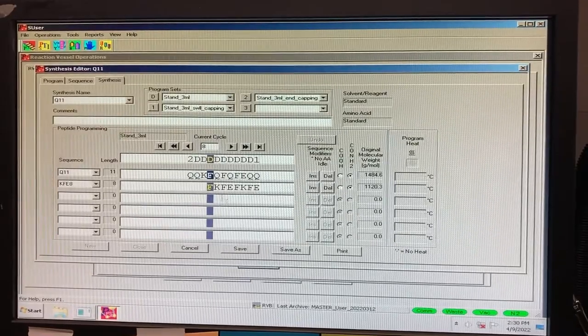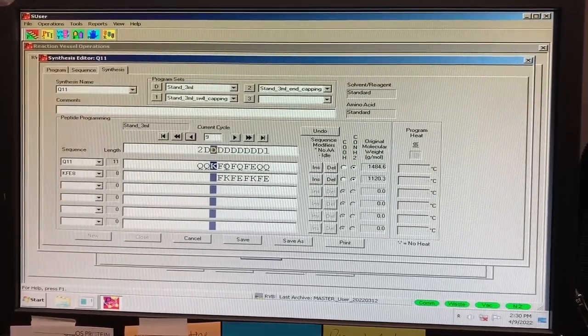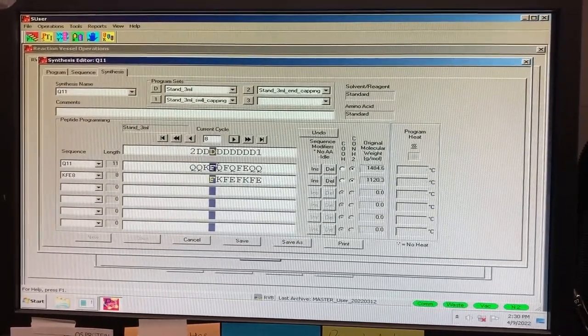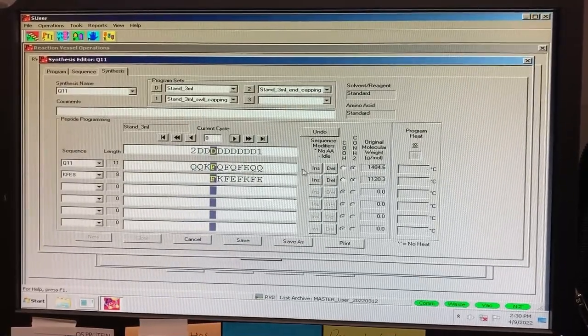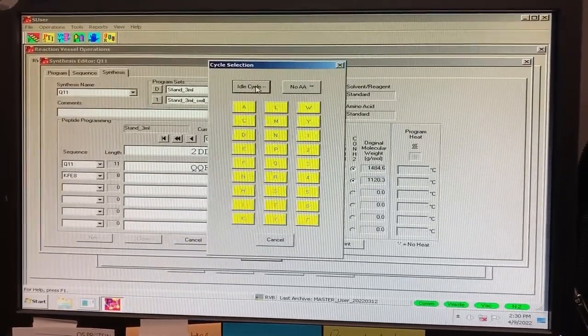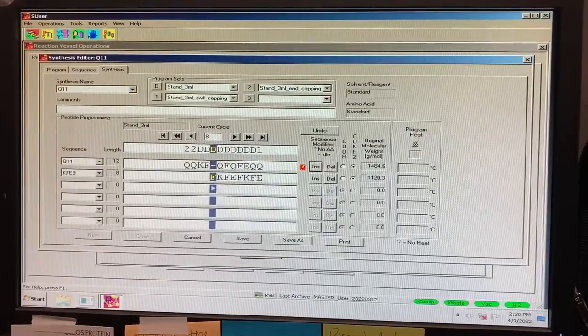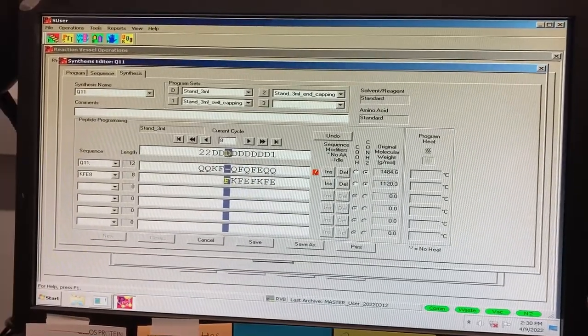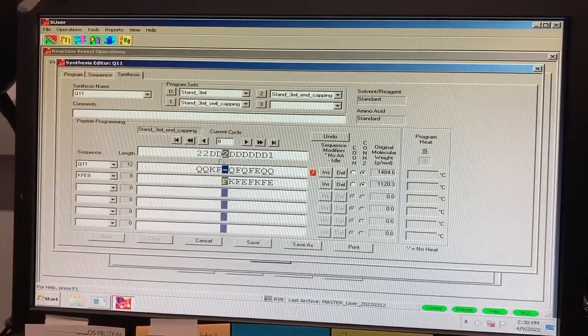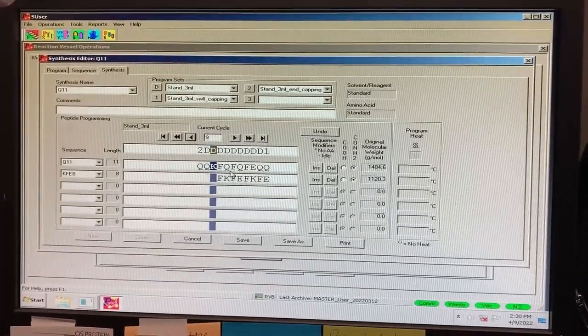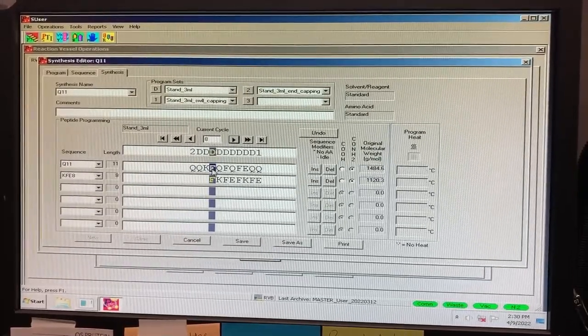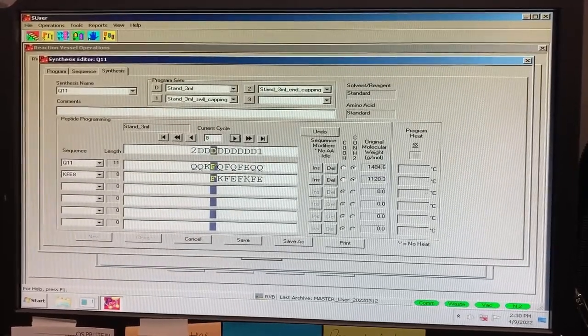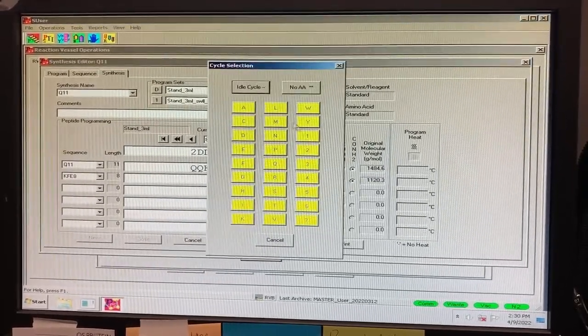when a shorter peptide is undergoing the end capping step, you don't want the longer peptide to be capped. You would then input an idle cycle into the longer peptide sequence, so that the capping reagents aren't directed into that vessel. You can input an idle cycle by selecting Insert, then Idle Cycle. If this option is not available, make sure that you are logged in.